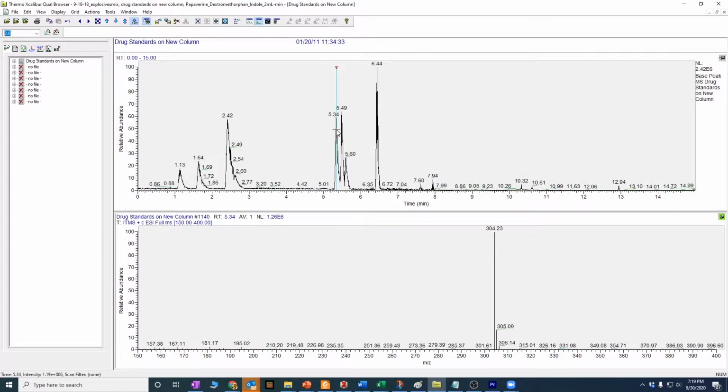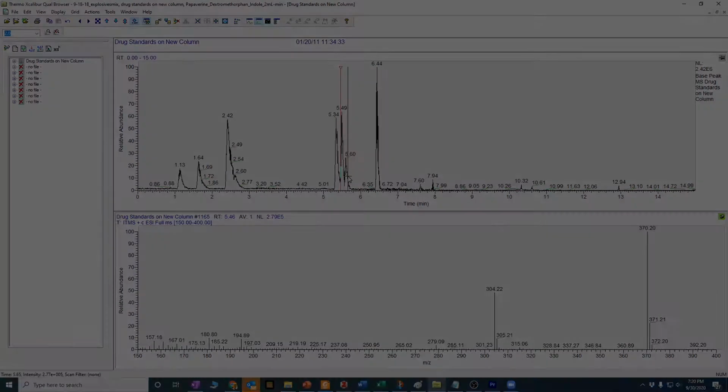So in our previous LC video, we clicked around in the chromatogram and saw the mass spectra below. If we look at the axes in the mass spectra, the y-axis represents intensity, and remember the x-axis represents identity. That's the qualitative identification. So in mass spectrometry, the identifying information is the mass to charge ratio, and that's going to be related to the mass of the compound, the fundamental mass of the compound.